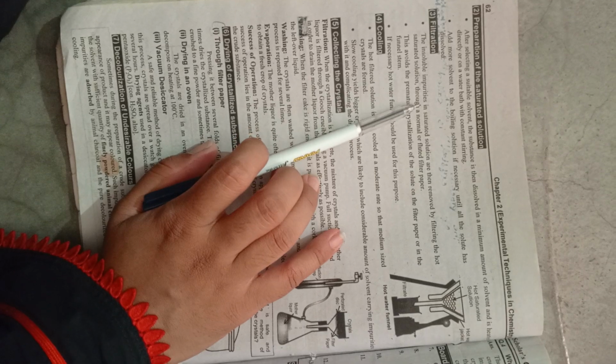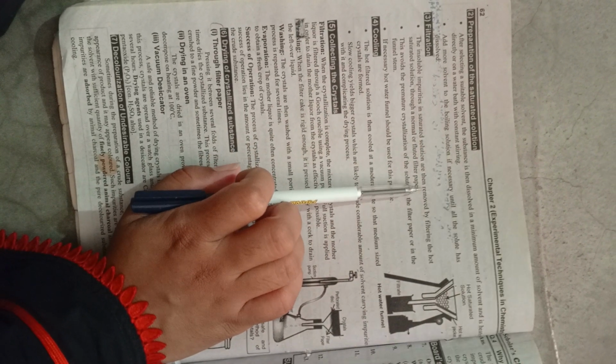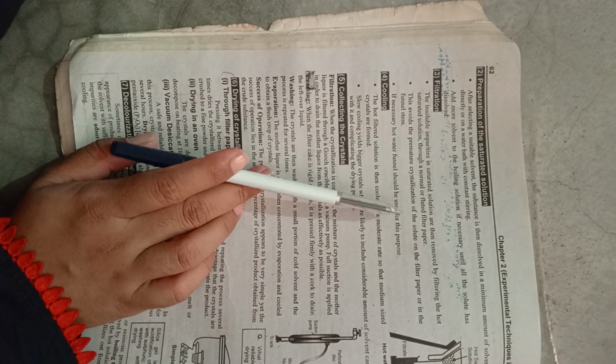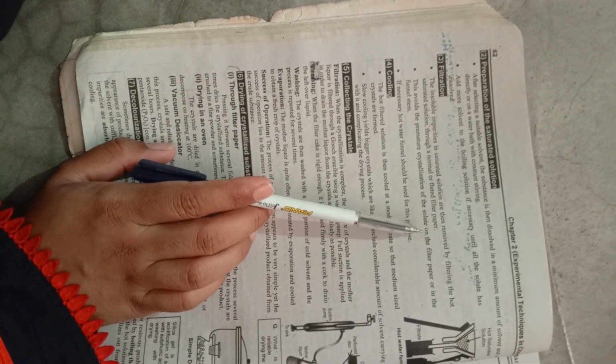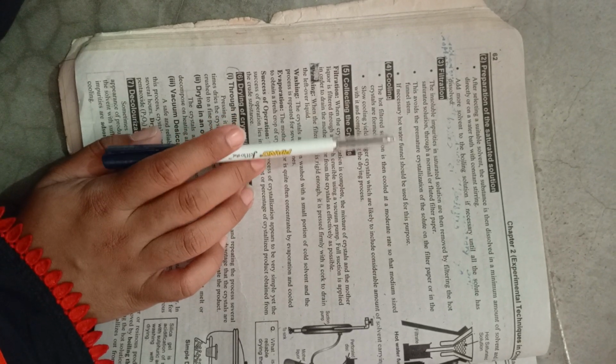Filtration है, the insoluble impurities in the saturated solution are then removed by filtering the hot saturated solution through a normal or fluted filter paper. This avoids the premature crystallization of the solute on the filter paper or in the funnel stem. If necessary, a hot water funnel should be used for this purpose.